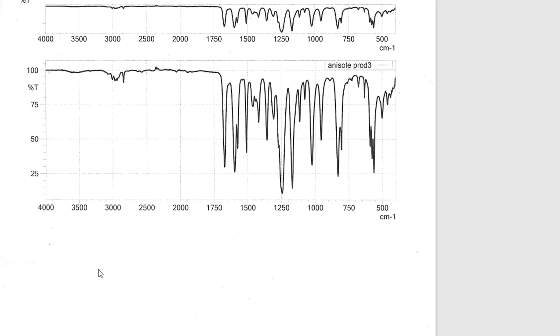And there's a few things that I need to make sure of. First, I need to make sure that we actually are making a carbonyl compound, because that was what made this product special versus the reagent. So first question, is a carbonyl present, yes or no? And you will be able to tell that from the FTIR. And in the lab directions on the grade sheet, it's going to tell you to circle the areas that had you make these conclusions. So there's your FTIR. You can print that off. You can circle it. You can do what you need to do with it and attach it to your laboratory write-up or your laboratory report.